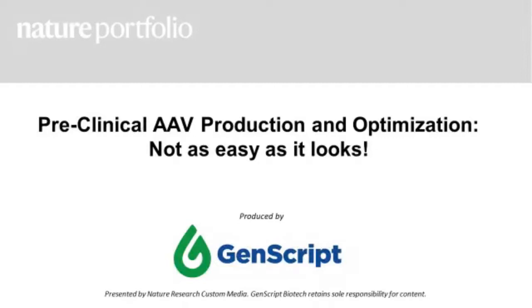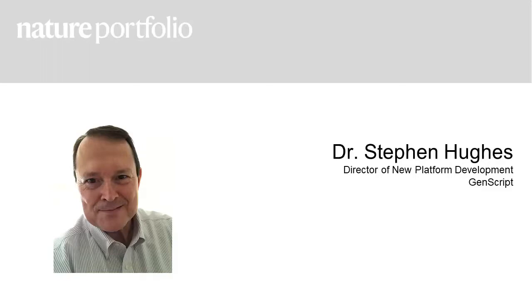Adeno-associated virus is the most popular vector of choice for gene therapy because of its low immunogenicity and ability to infect numerous cells and tissue types. However, with hundreds of gene therapy trials ongoing, manufacturing large quantities of viral vectors is becoming an increasing challenge. We'll begin by hearing from Dr. Stephen Hughes, Director of New Platform Development at GenScript, who'll discuss the current challenges and trends in preclinical AAV production and optimization, and discuss some recent advances in viral vector production.